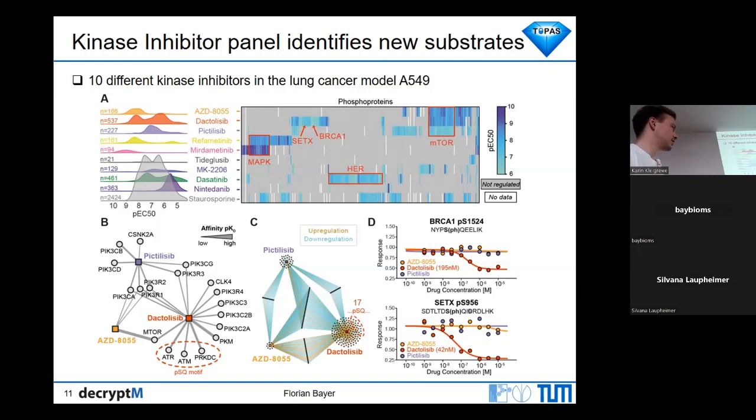And if you now go for these different sites, you find, of course, very well-known sites like this BRCA1 site. It's very famous, with this also famous SQ motif. But then there are also many other sites, like for this protein that obviously has the same motif and quite similar potencies. And therefore you can infer that this one here is probably being phosphorylated by either of these 3 kinases. And we can do this for the entire proteome and look at different phosphorylation events.